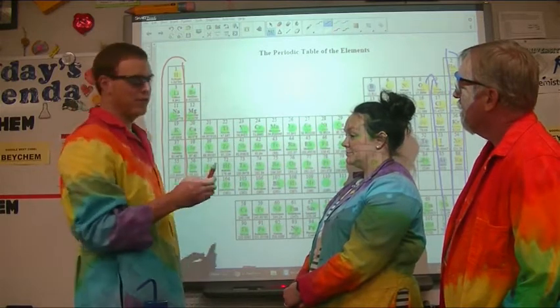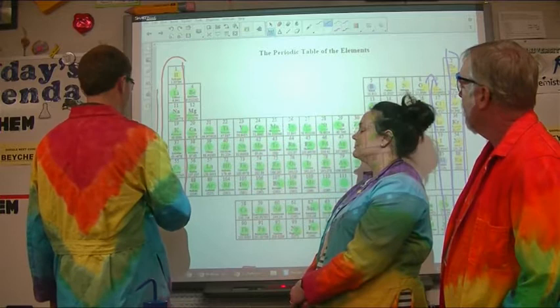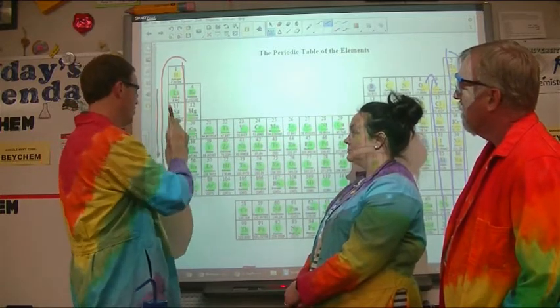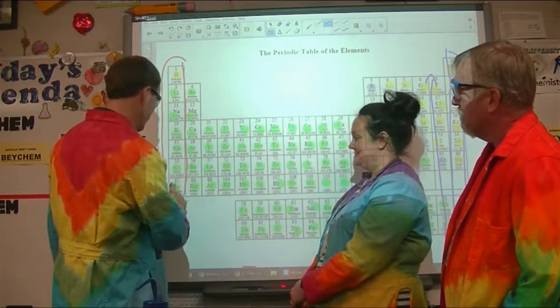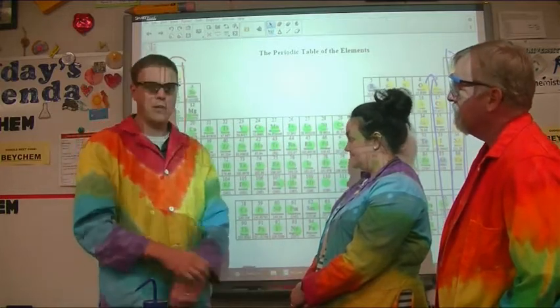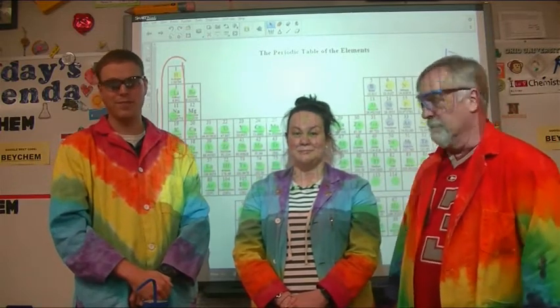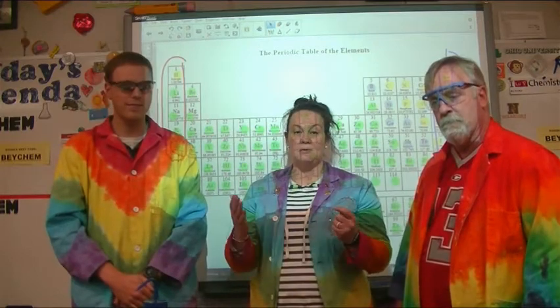Unlike nonmetals that get more reactive up the group, metals become more reactive as you go down the group. And so lithium is the least reactive metal, and then sodium is a little bit more juicy, potassium, rubidium. Francium is the big bad one here. That is crazy reactive. We're going to have some fun today playing with a little lithium, sodium, and potassium.